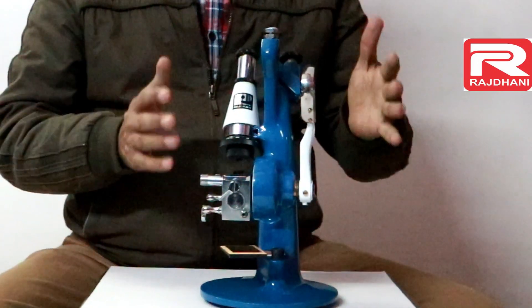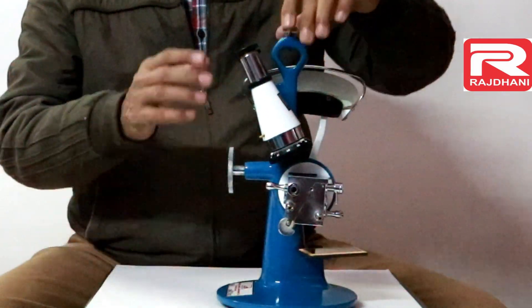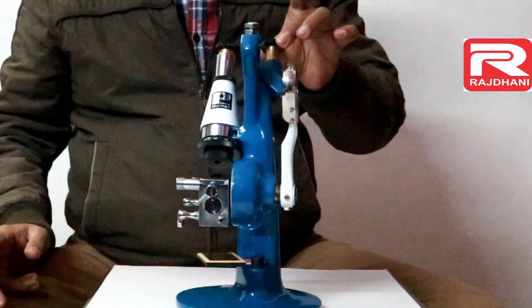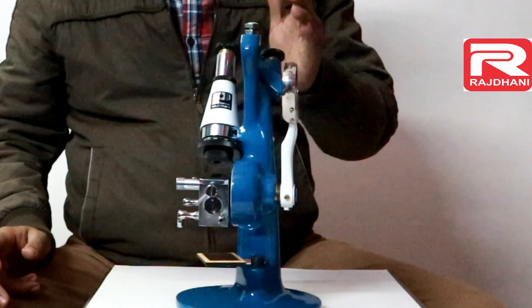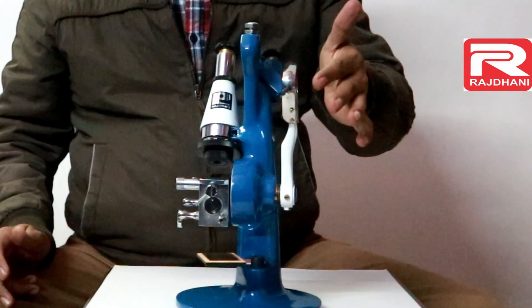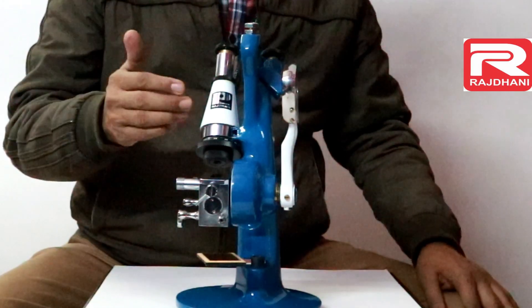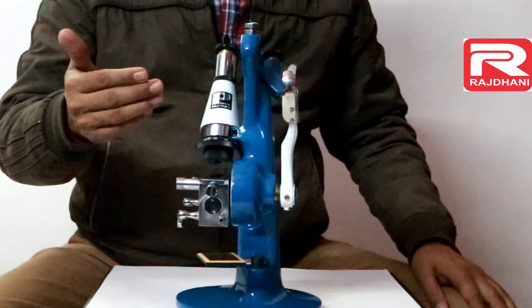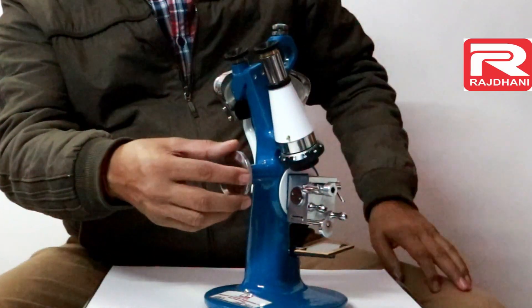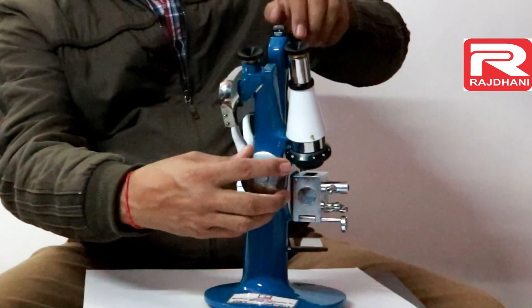This Abbe Refractometer is a basic model and it is a bench top model. This is a binocular type in which there are two eyepieces. The left hand side eyepiece — this black color left hand side eyepiece — is used to view the scale. This is the scale and this is the scale guard in which readings are there. On the right hand side eyepiece, we view the cross wire which is used to judge the readings. This is called the scale knob — while I rotate this you can see this scale is moving.